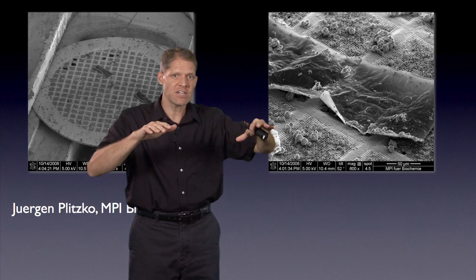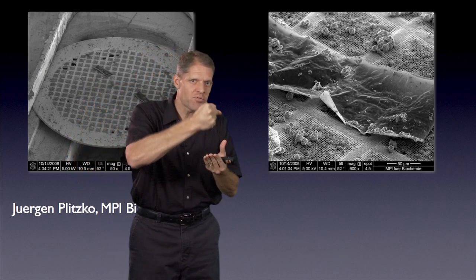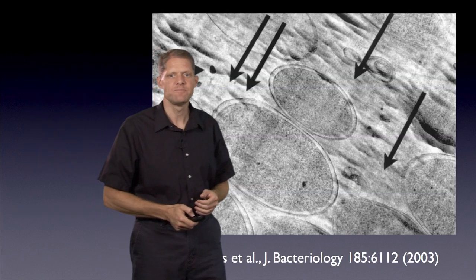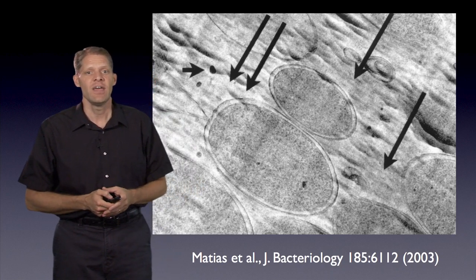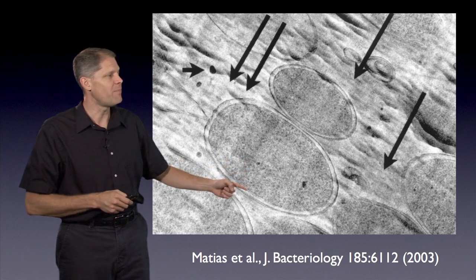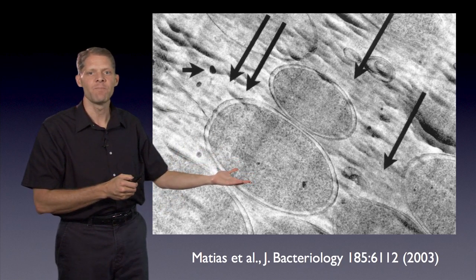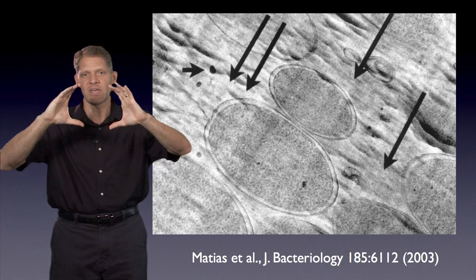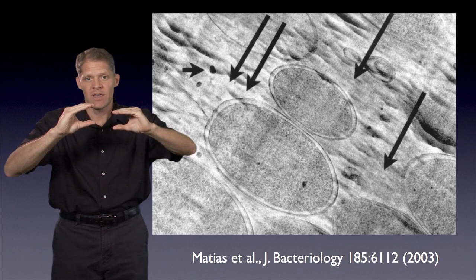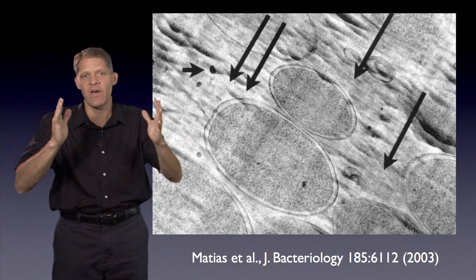So one of the challenges is to get the cryosection to lay down flat on the EM grid. Sometimes people will take a blunt instrument cooled by liquid nitrogen and simply try to press and crush the section down onto the EM grid, but it's only partially successful. In addition, when such cryosections have been imaged, it's been observed that there's a lot of compression that occurs during the sectioning process. These are images of bacterial cells that were high-pressure frozen, cryosectioned, and then imaged on an EM grid. These are rod-shaped bacteria, and so they normally look cylindrical. But in this case, after they're cryosectioned, they're compressed by 20 or 30% in the direction of the cutting blade on the diamond knife. And so this introduces artifacts into the image.